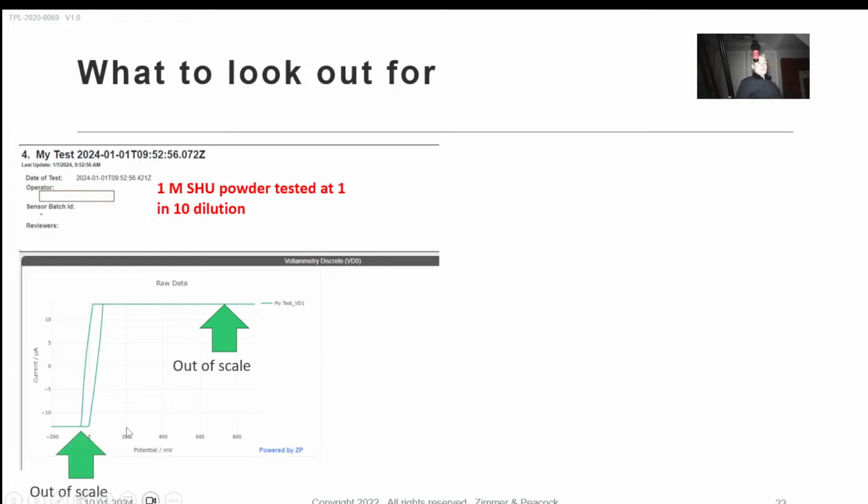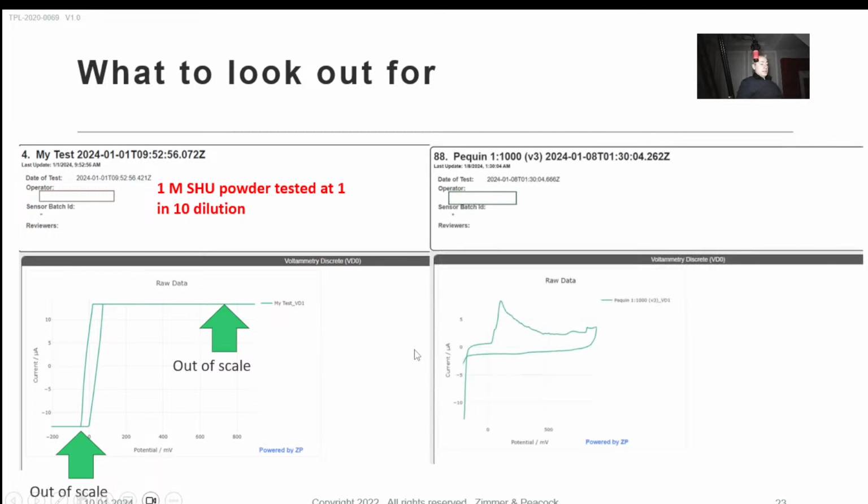So I know what I'm looking for, and we can make sure that things are okay. By the way, if this does happen, the app will report it's under diluted, so you don't just not know, it does actually tell you. But somebody like me comes in, we have a look at that, we say, right, it's just not diluted enough.